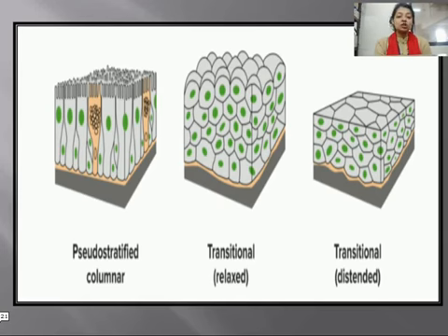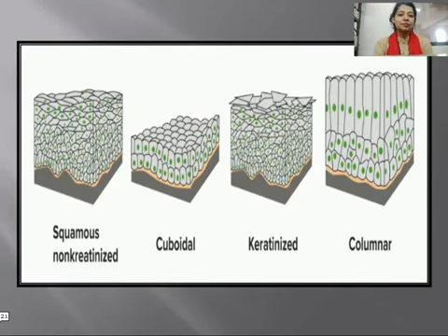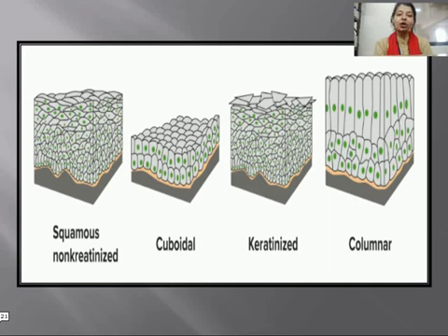The next two images show transitional tissue — one being relaxed transitional tissue and the other being distended transitional tissue. This slide also shows squamous non-keratinized tissue, cuboidal tissue, keratinized tissue, and columnar tissue.